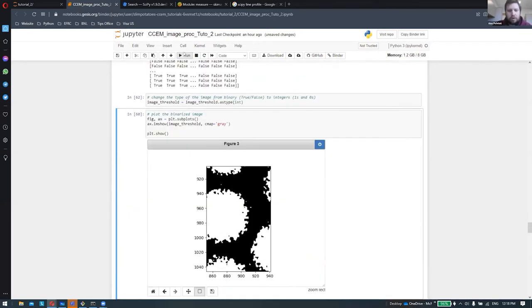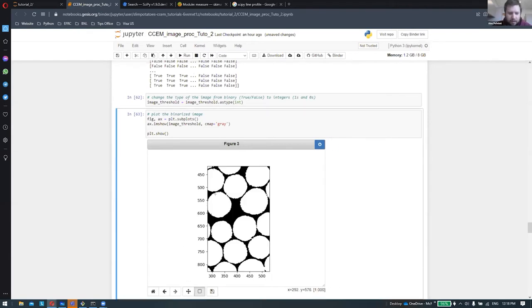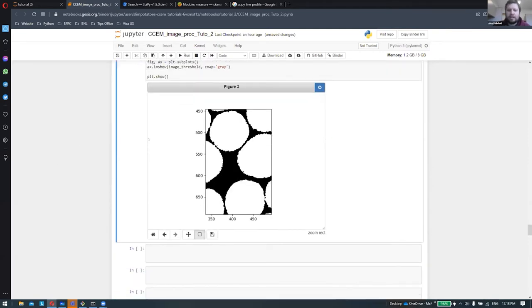I don't remember the value I used, so we're gonna go with something like that. It's just that it's visually more appealing in that case. When you have something like that, there is some danger that you see some of the particles might be touching. So we will see how it goes with those settings, but that's basically what we're gonna go through.